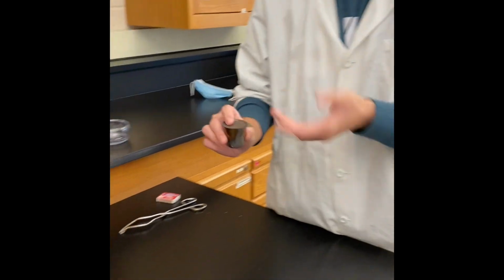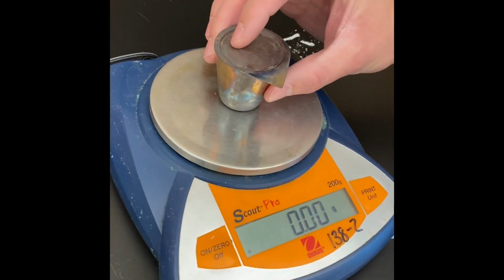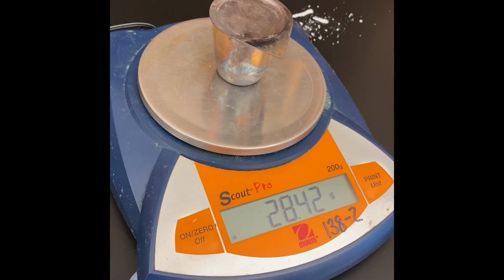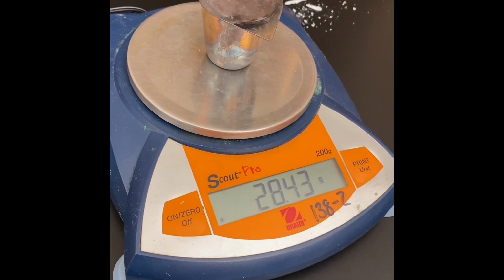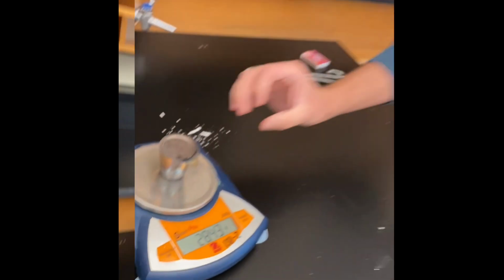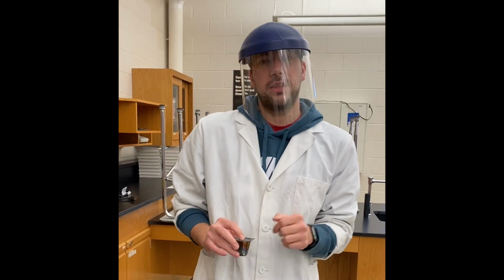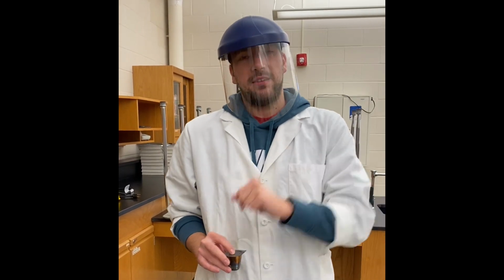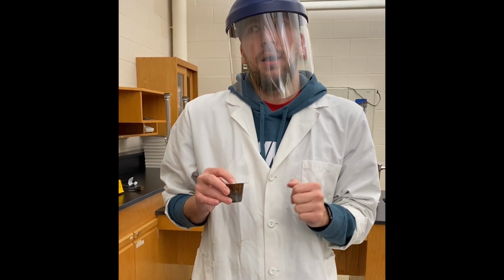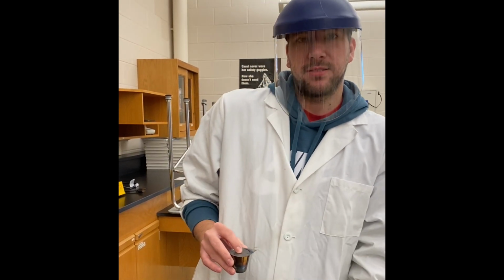So I can now take the mass of my crucible, lid, and magnesium oxide. I have a final mass of 28.43 grams. All right, and you can use that data now to calculate the mass of the magnesium, the mass of the oxygen, and then go through the process to determine the empirical formula of magnesium oxide experimentally.